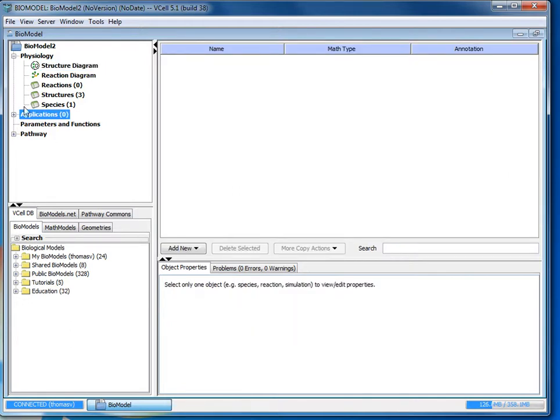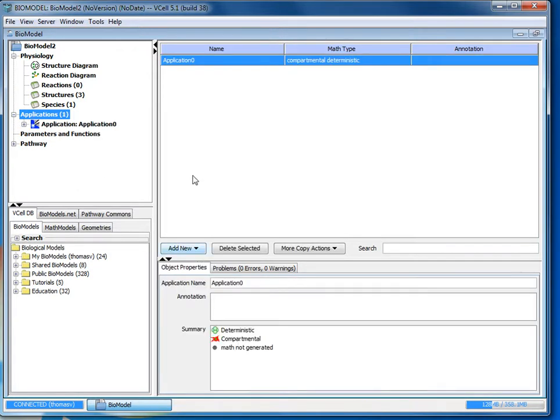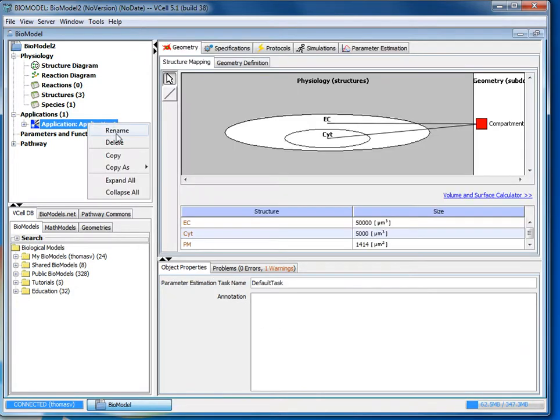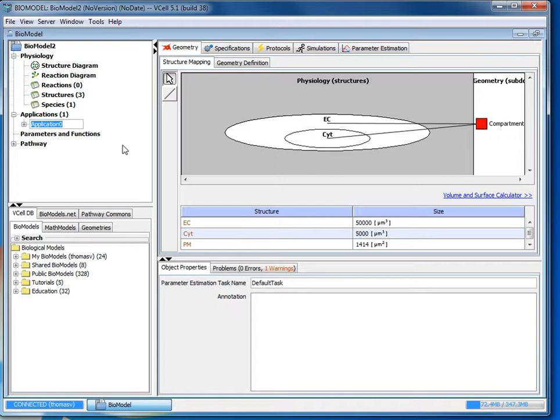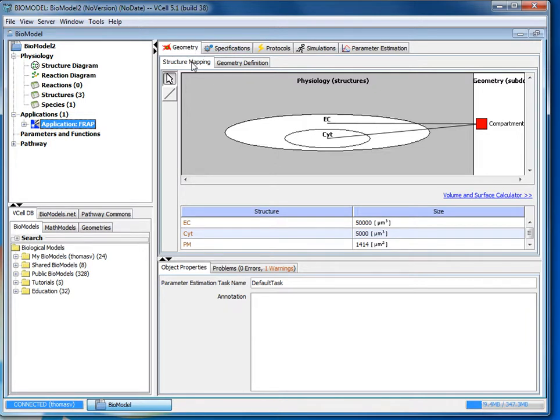Within the navigation tree, click where it says applications and select add new deterministic. And now you can rename your application by either double clicking here or right clicking and selecting rename. And for this tutorial we'll just name it FRAP. And now that the application is selected, you should be at the geometry window by default.